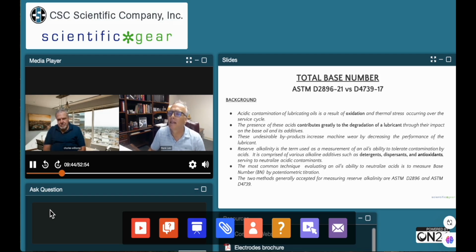Measuring TBN is important to understanding the health of the oil, or the ability for it to stay healthy over time. Would you say that? Yes. Okay, I like it. I got that right.